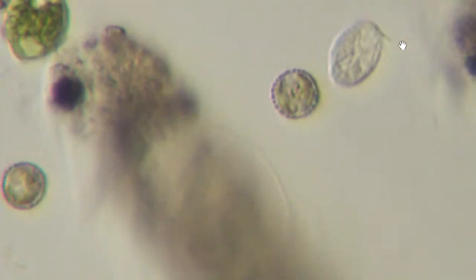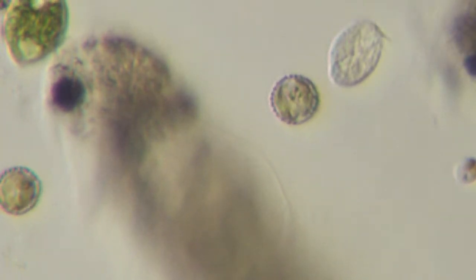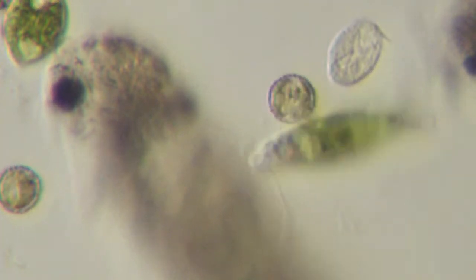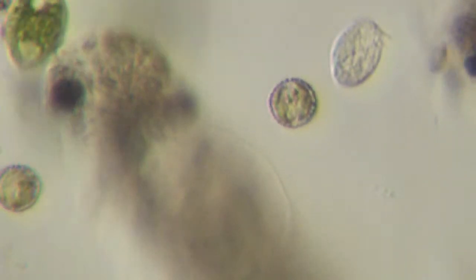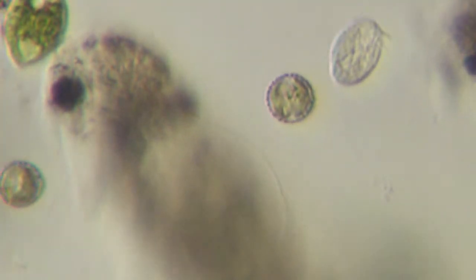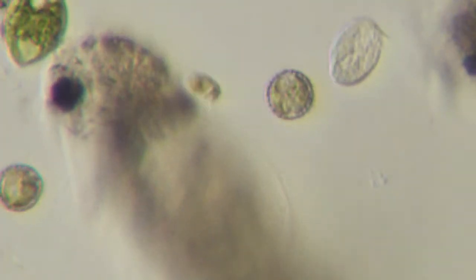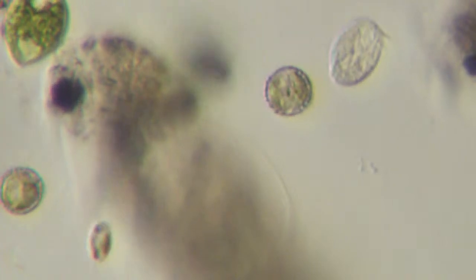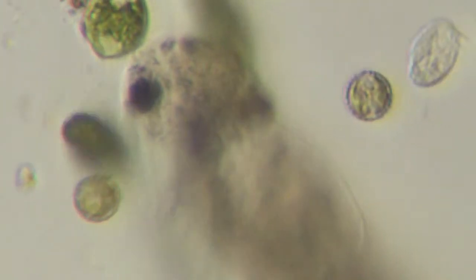I should get a clear shot, but I don't want to go to oil yet, because once you go to oil, you can't really go back and use other objectives because you risk putting them in the oil and destroying them. This particular one is a replacement objective that I did put in oil at one point, and the numerical aperture is not 100% the same, so I have a lot more focus issues with this one over the original that was here, so I have to go find out why that is. But for now, it does work. I'm getting some good images out of it. It's just very finicky with the focus.